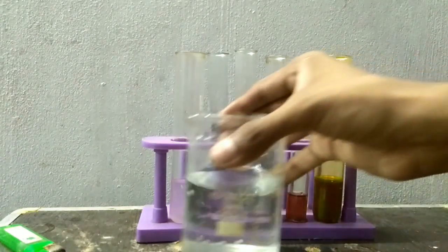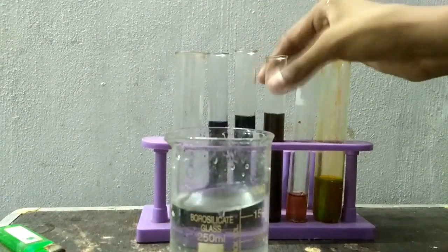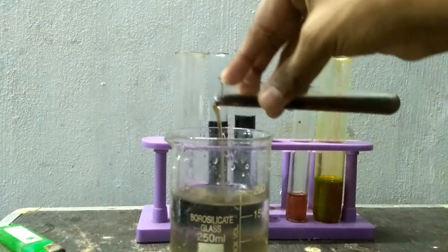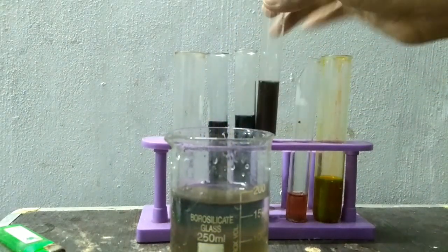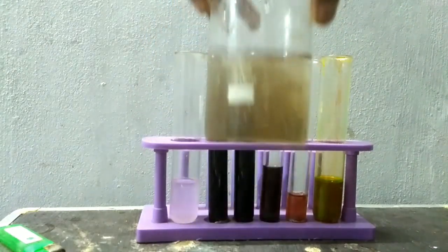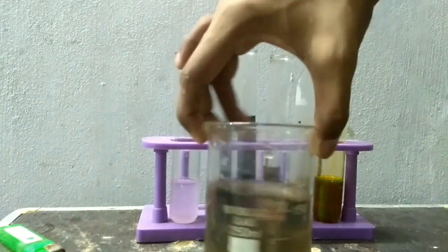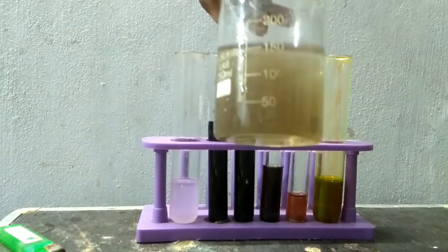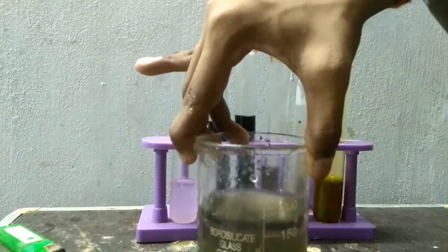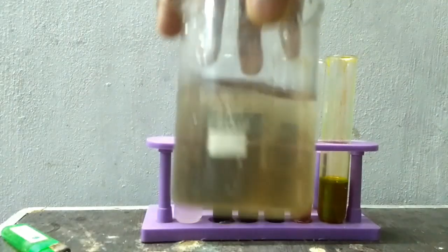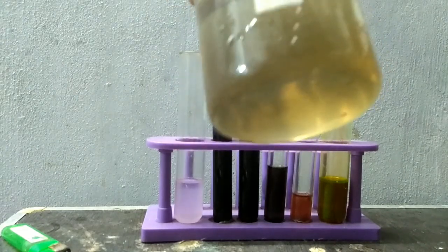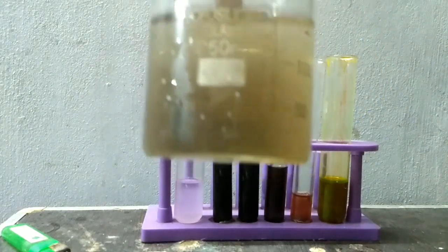Now I will pour beta naphthol to it. This is beta naphthol one. Let's observe. It has a light green color. It has a light green color or rather a dirty green color we can say.